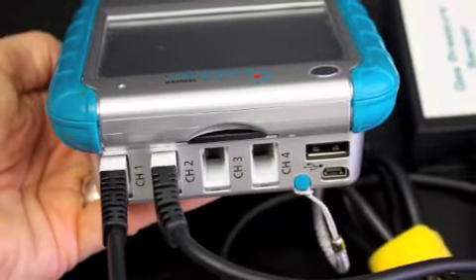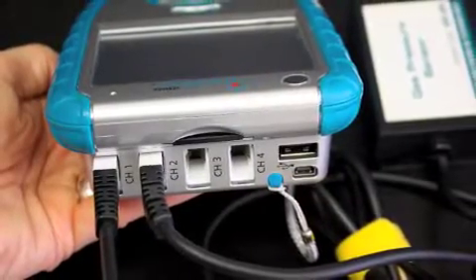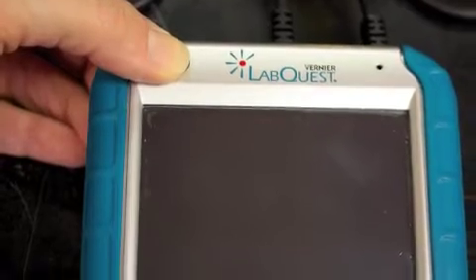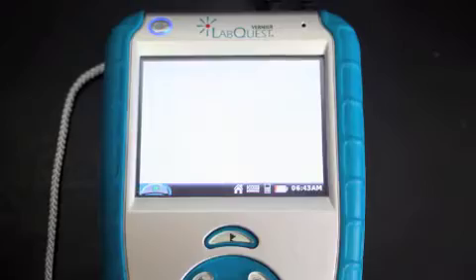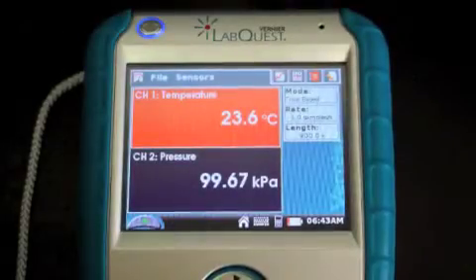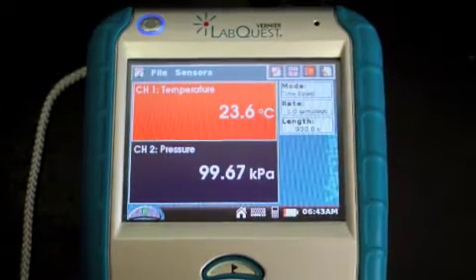Plug a stainless steel temperature probe and a gas pressure sensor into two of the channels in the top of your LabQuest. It doesn't make any difference which two channels you plug into. Turn on your LabQuest by holding down on the power button on the top left corner. It'll take a couple of seconds for the LabQuest to turn on.